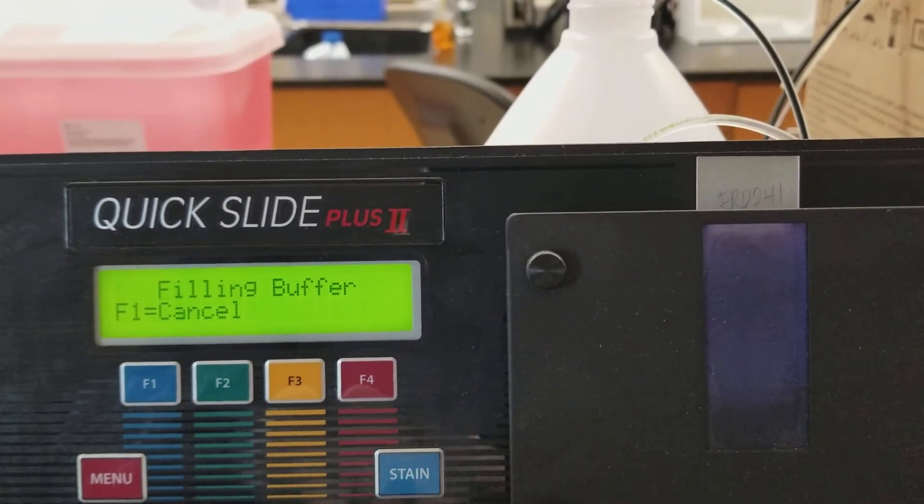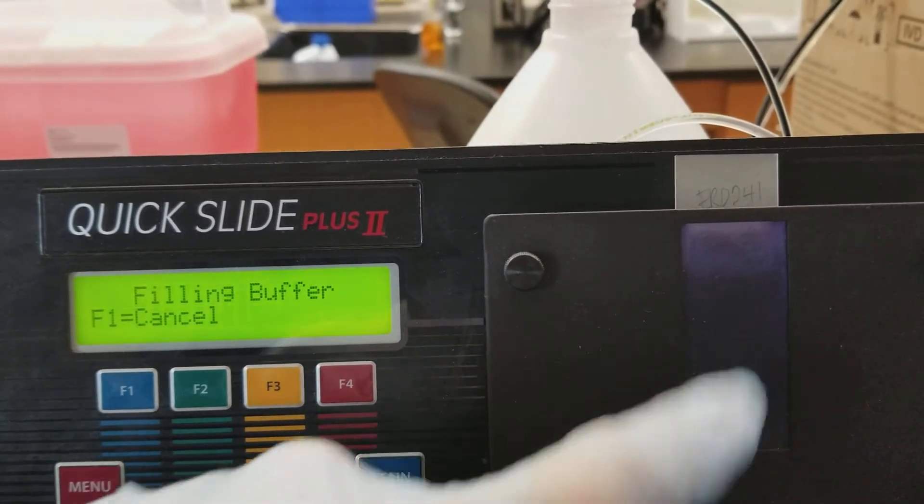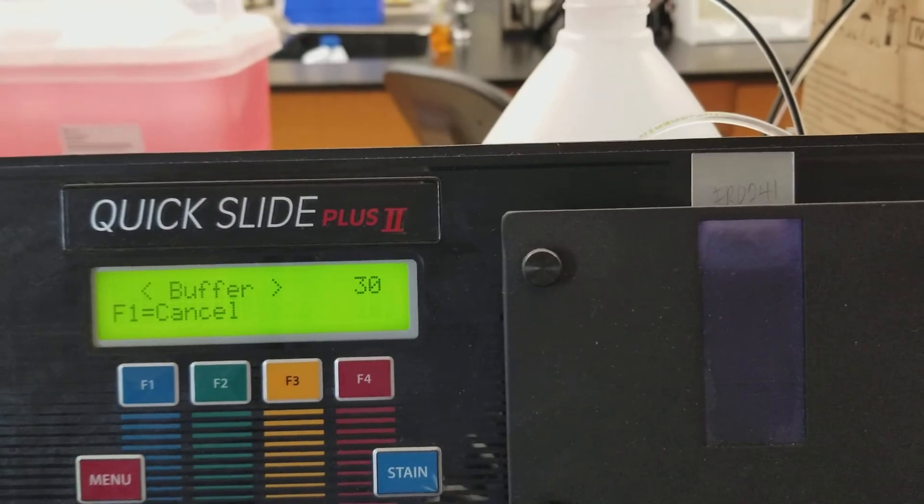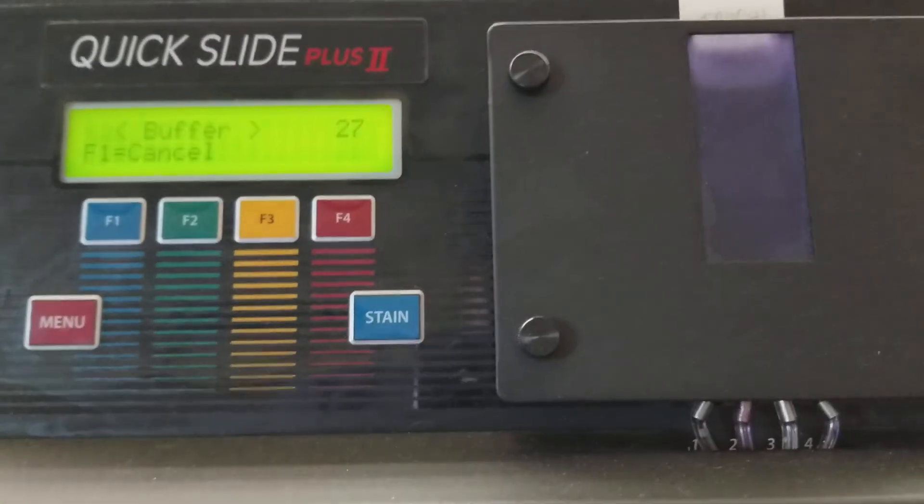So it's draining it out. Now it's going to fill it with buffer. See how it's coming up, rising up in the cuvette? And that's going to be for 30 seconds.